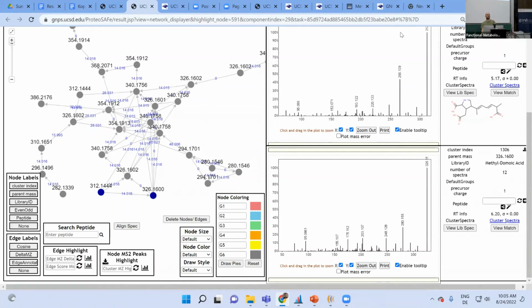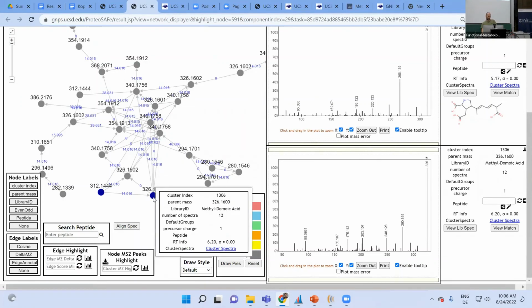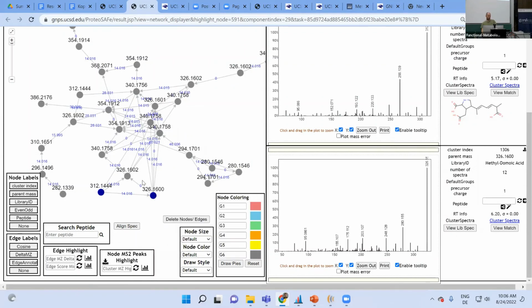Another question? Yeah, I have a question. One is one substructure in GNPS, and the second one is, can we locate in which sample this component is? Yes. So for feature-based molecular networking, right here out of the network view, there is not. If you do classic molecular networking, you can, because you can subdivide this in these default groups here, and then you can label from which group it came from.